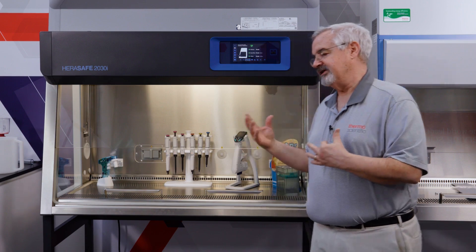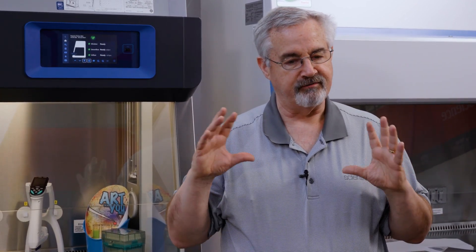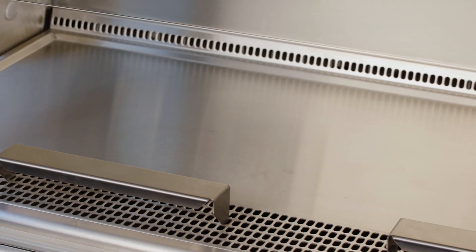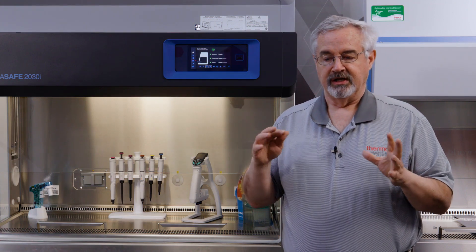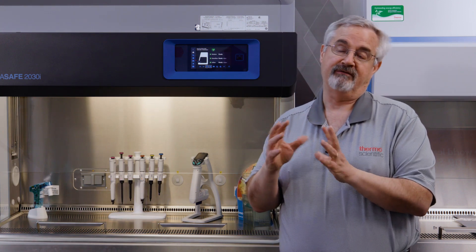For containment, this cabinet has SmartFlow Plus — an enhancement to our intelligent compensation system. It is a fully independent system that monitors the flow through the downflow and through the inflow, and will adjust fan speed to maintain the proper velocity. It also has Dave Plus, an enhancement to our flow monitoring system where, instead of monitoring the pressure drop across the filters as an indicator of flow, it actually monitors the flow through the motors — which is even better, as it's independent of the filter loading.